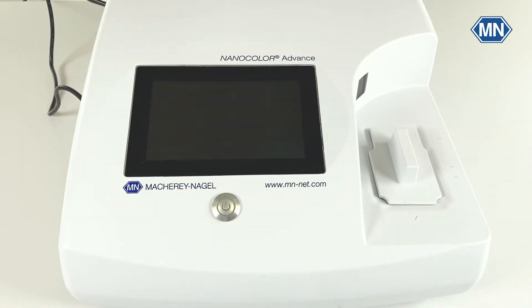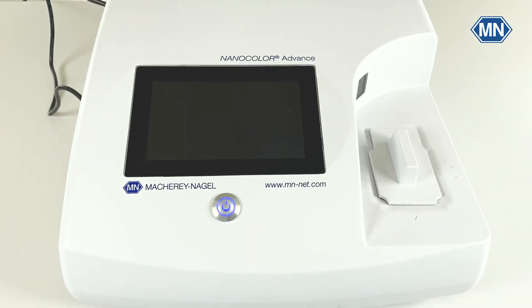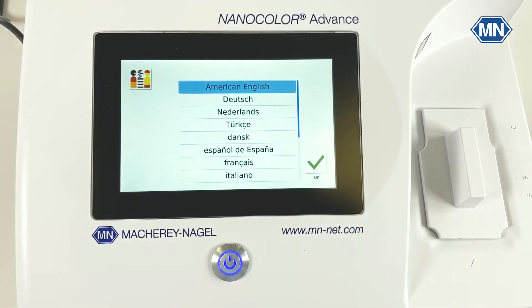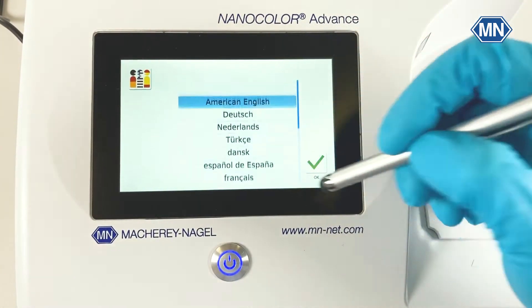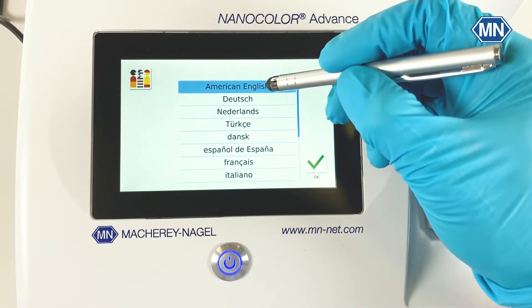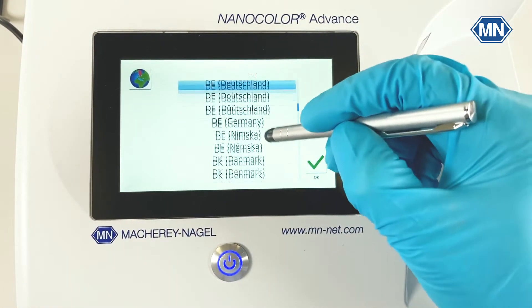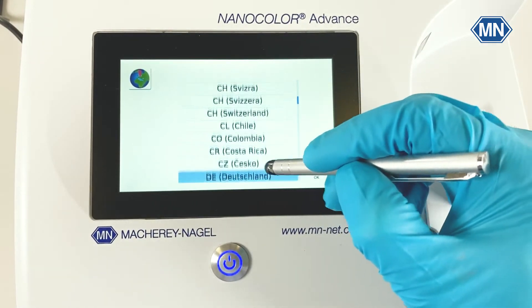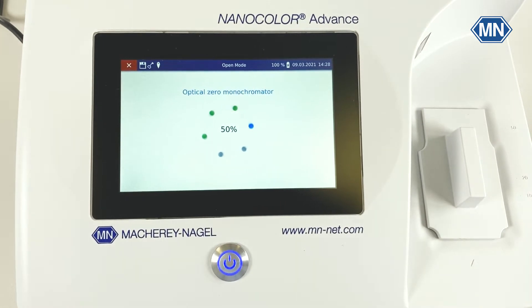Once the device is charged, you can turn it on by pressing the button here on the front. Once the device starts up, you can choose your language and your region from two lists. In the first, select your language and confirm with OK. In the second one, select your region, again confirm with OK. Afterwards, the device will start up and perform a series of self-checks. Just let it run for a few minutes and you're ready to go.